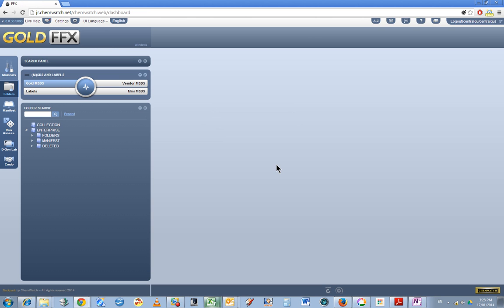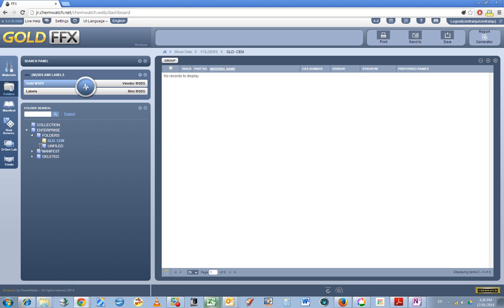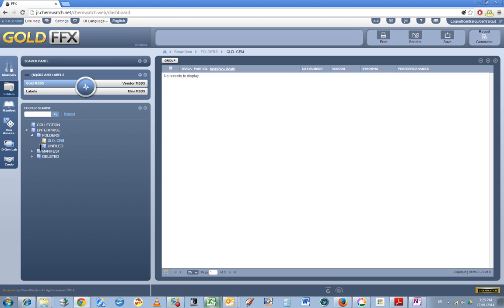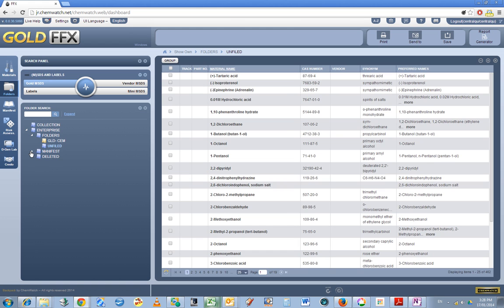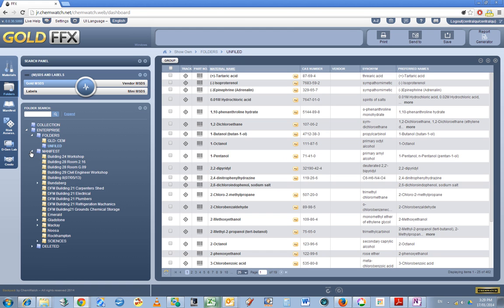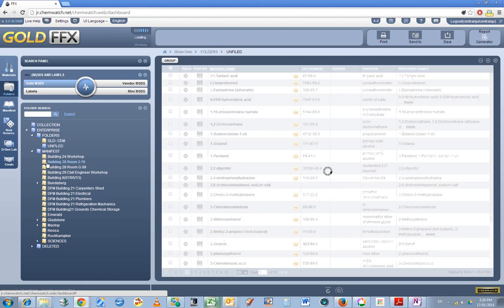I've just put in those login details and bear in mind you've got to watch your caps lock, that can stuff things up. It's showing the folders here. If I click on folders and expand out, manifest, and I'm particularly interested in building 28 room 216.